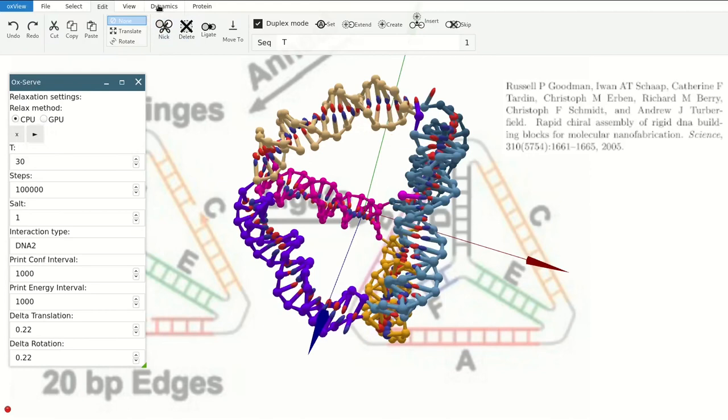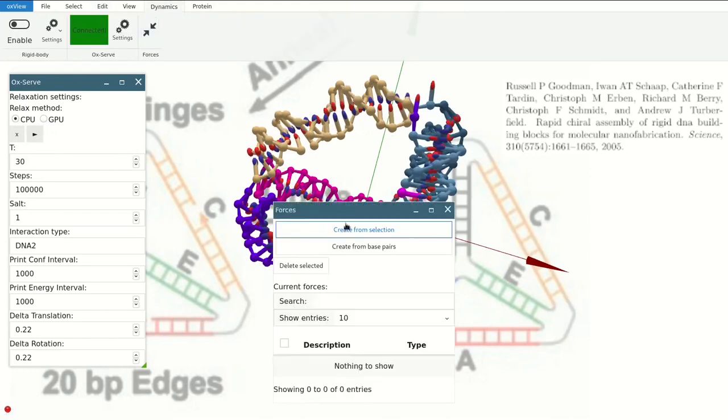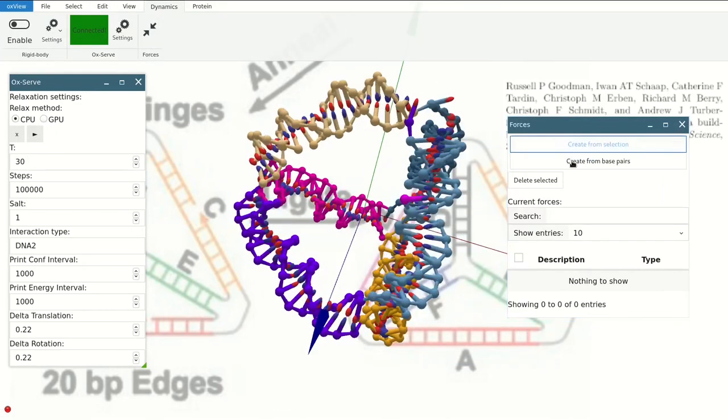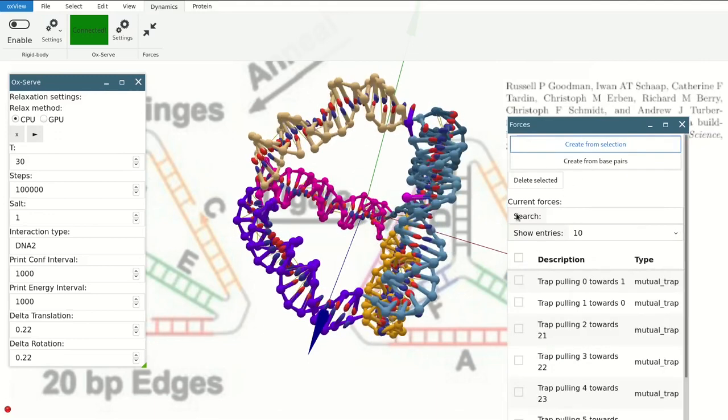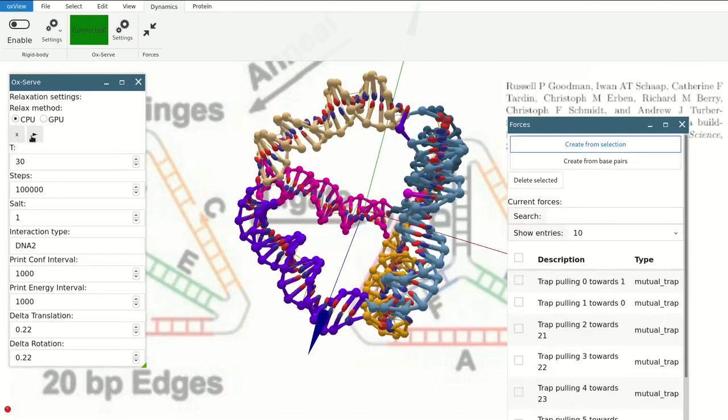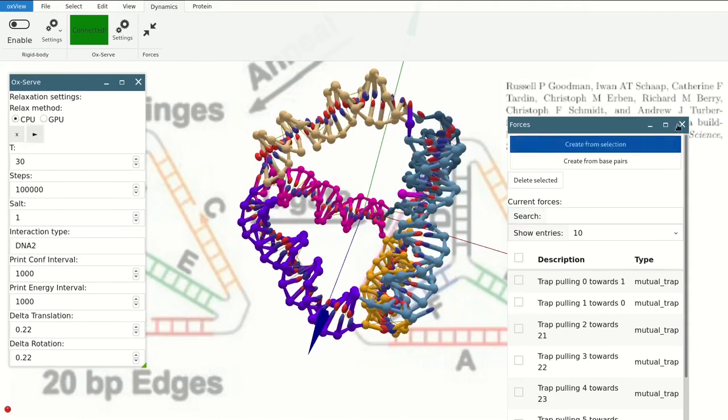If I wanted to add some forces, maybe have from all the base pairs so that they are pulled together, then I can just create from base pairs and we have all these trap forces as you can see here. If I just restart the simulation, it will take that into account, which is pretty nice.